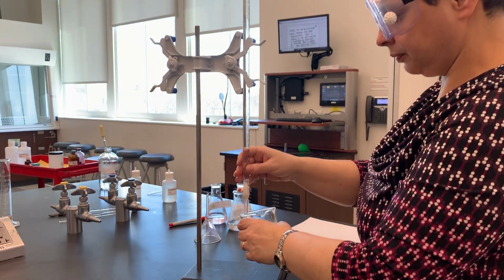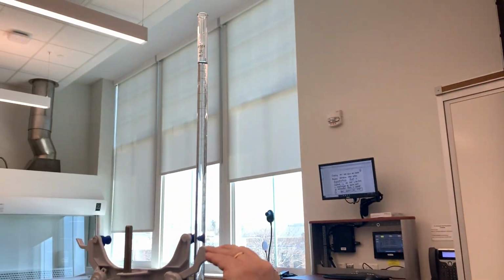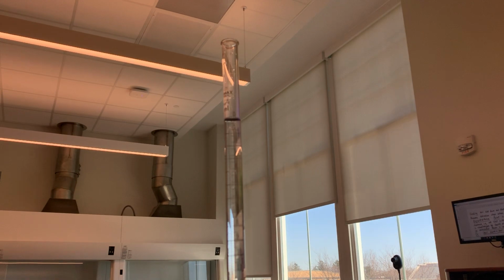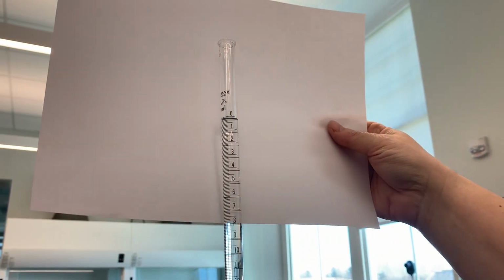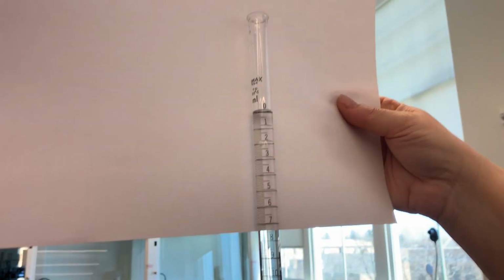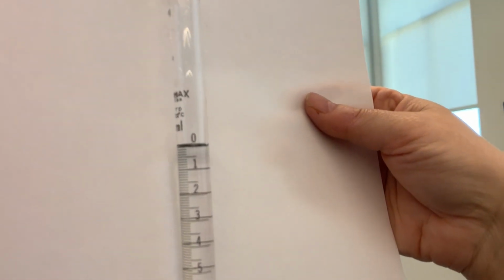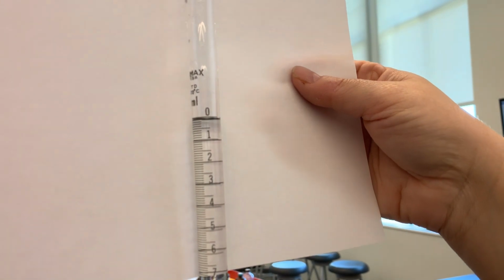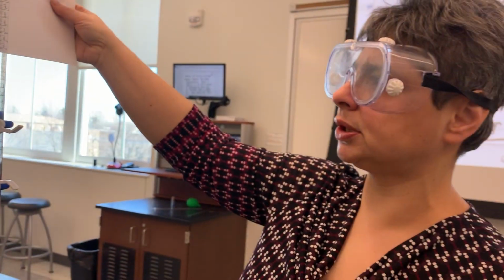So the bottom of the meniscus, which I have to read, is now a little bit below 0. I'm going to lower this so I can see better, and I'm going to put my white piece of paper behind it so we can take a look together. It seems to me that the meniscus is right between 0 and 0.1. So I would record my initial reading here as 0.05 milliliters.